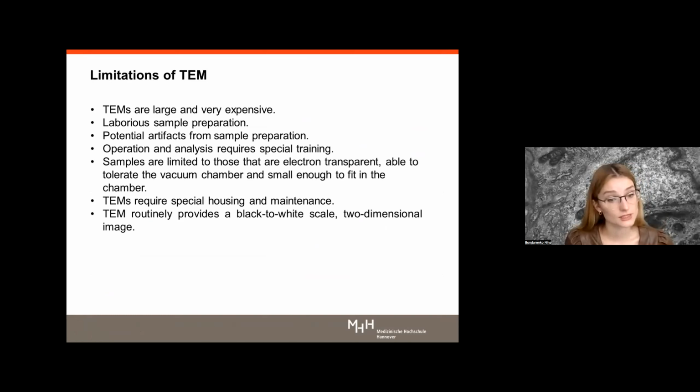requires laborious sample preparation. It's a huge amount of work to prepare a really well specimen for the analysis, because as I described all these steps and the structure of the electron microscope, you can understand that it's a high-tech method, and for sure for this method we need a perfectly prepared specimen, tiny, thin, and well contrasted, and this requires a lot of work.